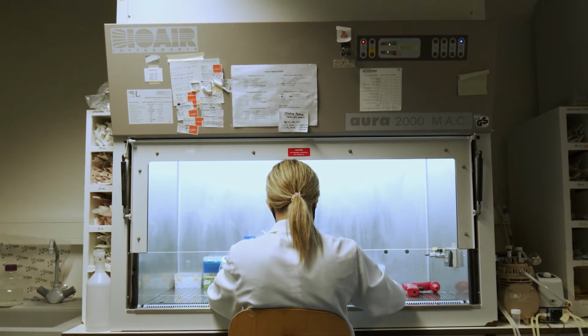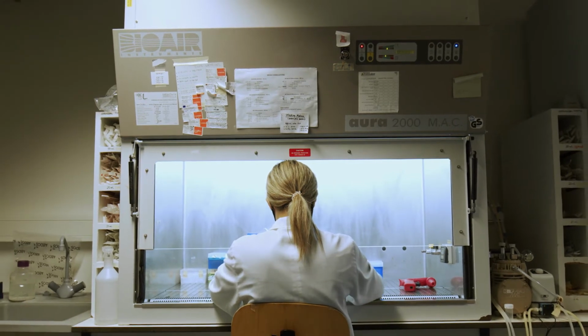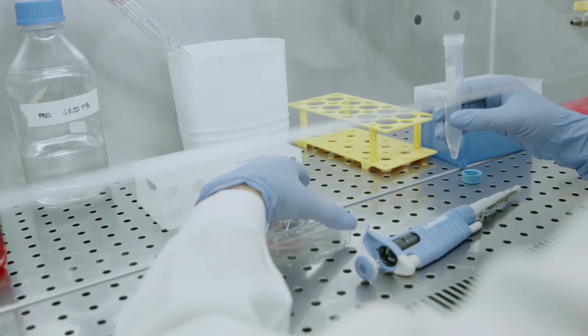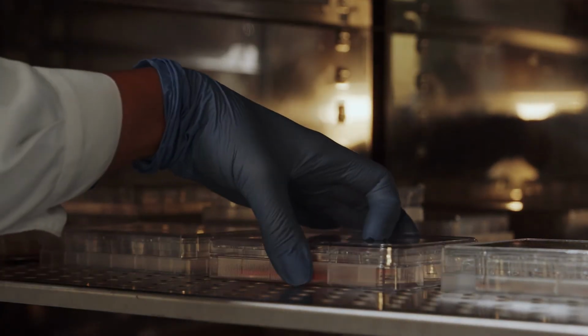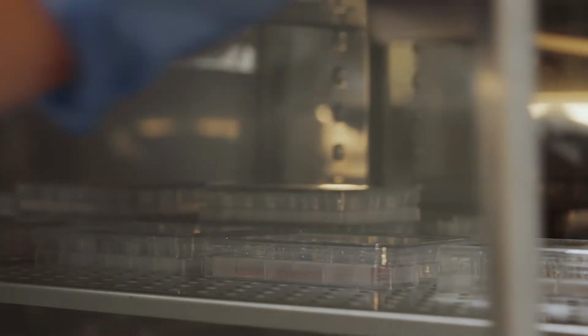StemScale is indeed robust and allows us to replicate the results despite the cell line that we use. Its robustness also allows us to obtain very similar results between different passages, or even between different cell lines. There's just a few things that you need to consider to obtain the best results. The first one is to pay attention to the confluency of the adherent culture that you are starting with. You do not want to let the cells grow too much. You want to keep it at about 60% confluency before dissociating the cells to start the suspension culture.